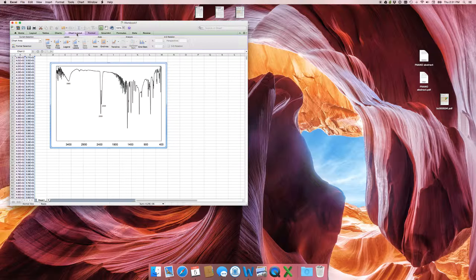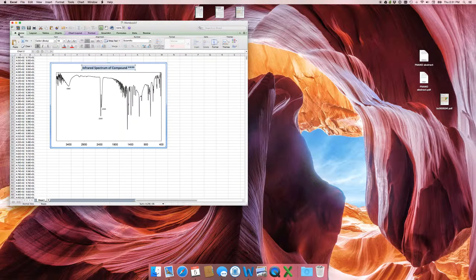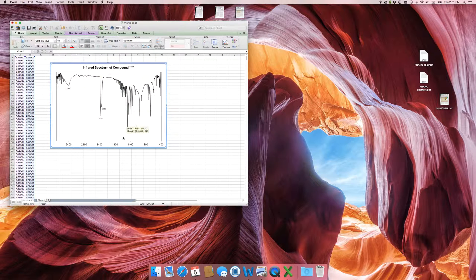You're going to need to put labels on the axes. Go to Chart Layout, then Chart Titles — place the title above the chart. Type in something like 'Infrared Spectrum of Compound [whatever it is].' Make sure the font is Arial, not Calibri, because that's the font of science. Around size 16 looks fine.